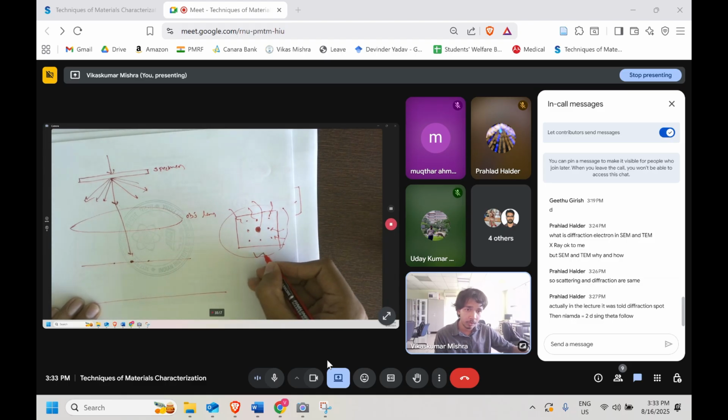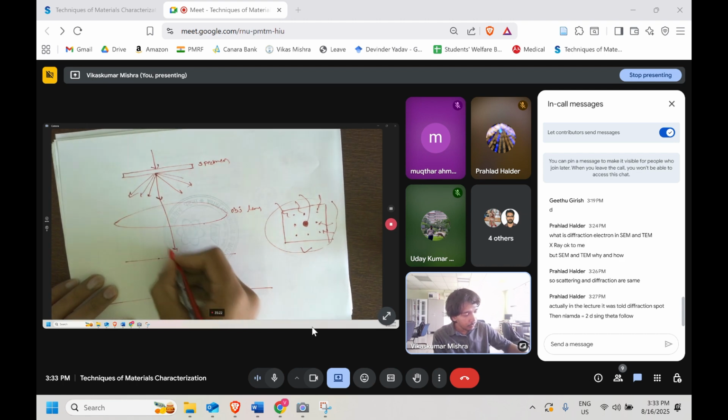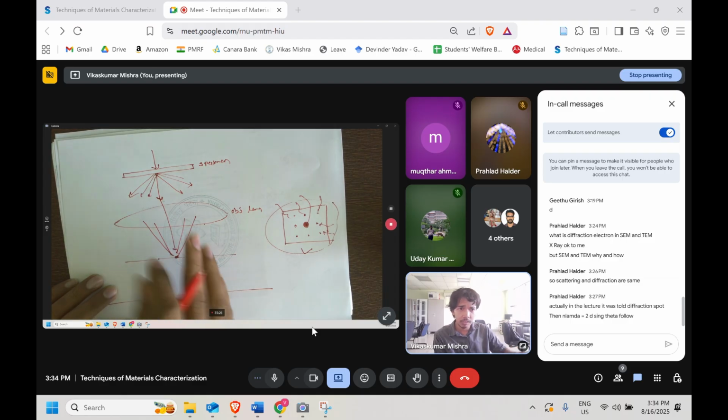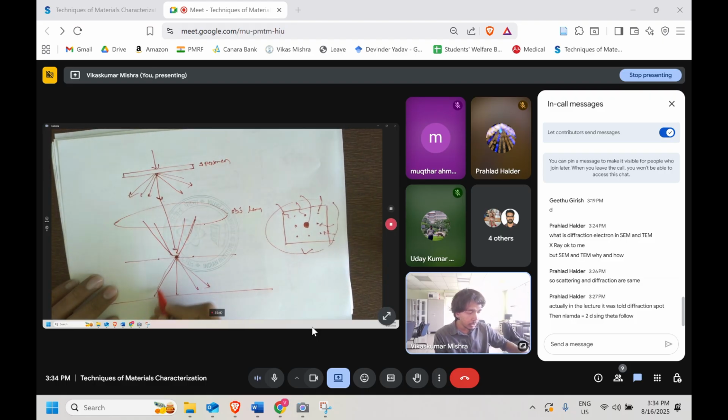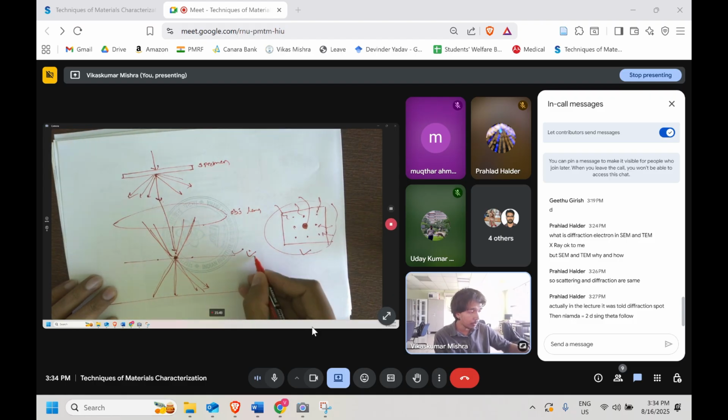Now, using each of these diffracted spots that we have got, we can image them. Let's say we converge the beam to a particular point. This particular direct beam we have converged. It interacted and it's converged more or less, and now we are seeing it. While we see, we will project it onto the screen. Now this is just going to give us the information. So you can convert the diffracted spot pattern to the image.